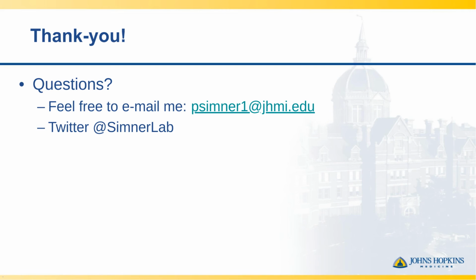So let's get started. Our first question is two parts. Any idea why cefiderocol resistance is mainly seen with NDM producers and not other MBL producers? And how exactly did you notice the multiple copies of NDM-5?